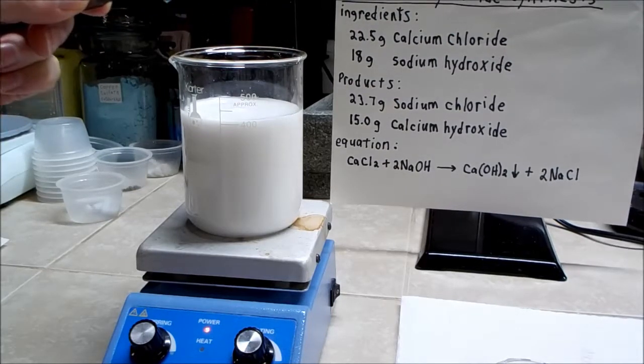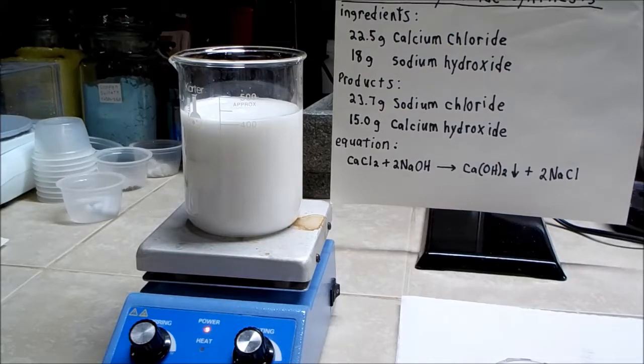Definitely alkaline. So we'll let it stir for a little while just to make sure it's complete, then I'll give it a filter and a washing or two and evaluate the results.